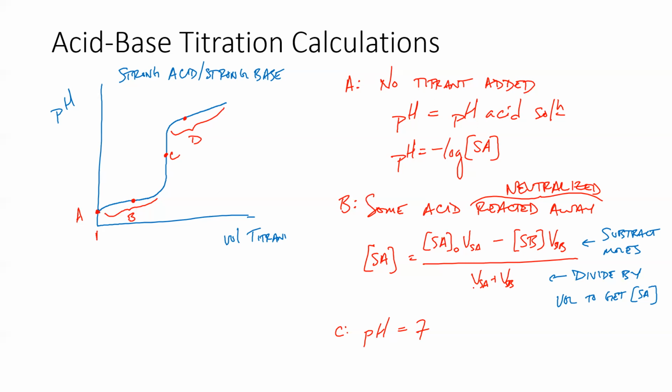Again, also, if you'll notice, the titration curve is almost a vertical line around that equivalence point. And that's why it's okay to use an indicator that has an endpoint at a pH of 7.7, like phenolphthalein, because the amount of volume necessary to go from 7 to 7.7 is much less than one drop of our titrant.